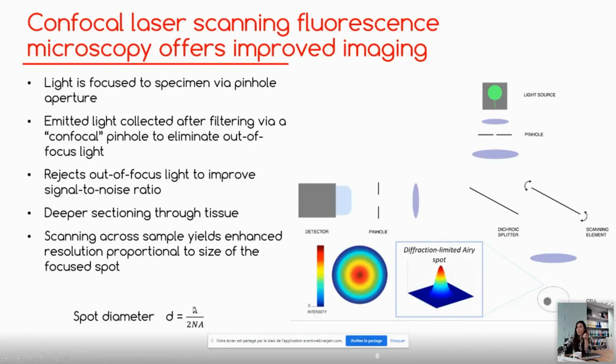That's proportional to the wavelength of light that we use to excite with, and also some properties of our objective, like the numerical aperture, which corresponds to the angles of acceptance that we can have. So this is going to become very important for being able to see things small. So we can only see as small as that diameter, roughly maybe divided by 2, or we can only detect 2 nearest neighbor objects if they're at least this distance apart.